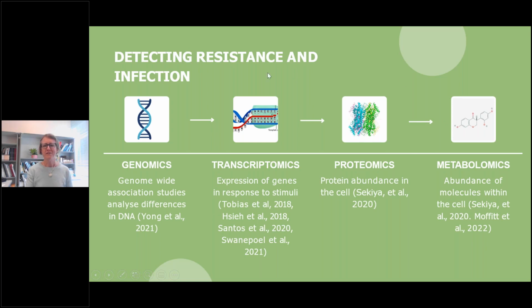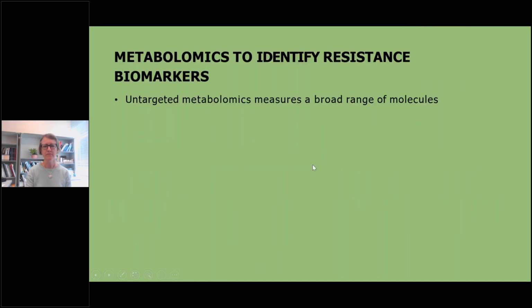All of these different tools are fantastic because they all work together and help us understand in more detail what's happening. The more we know, the better we can understand the system. In particular, we used a tool called untargeted metabolomics. Like genomics, which is the study of all of the genes within a host genome, if we were interested in one particular gene, we could target that gene, but we often get more information by looking at the whole genome.